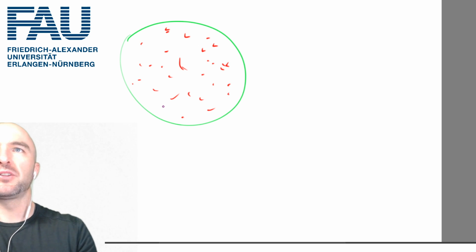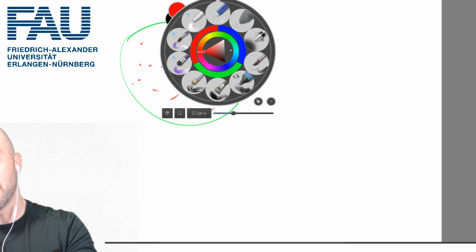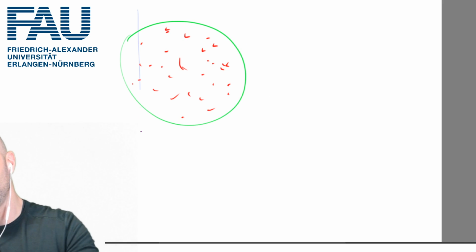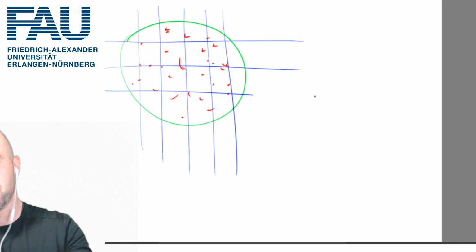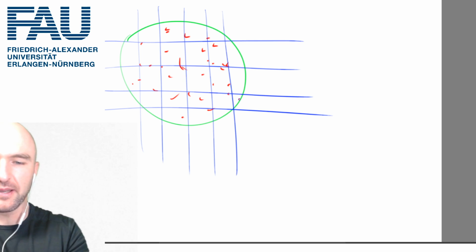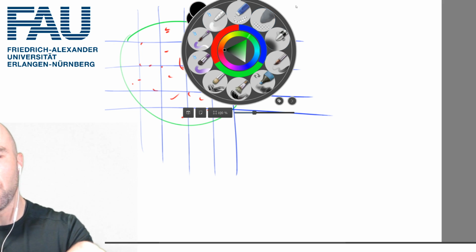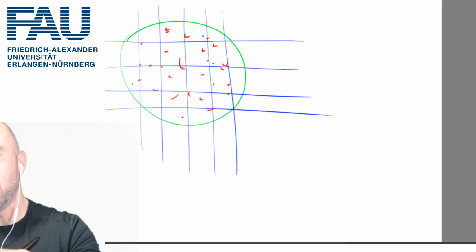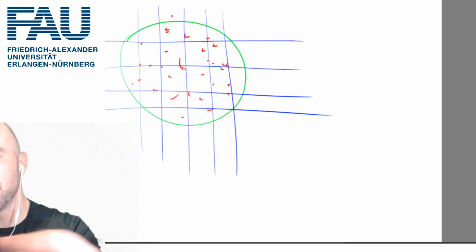And what we're essentially doing is, oh, it's finished, so it didn't take all that long to calculate. So if we are trying to put that into some kind of grid, what we're doing is essentially saying, okay, does this thing here belong to this voxel, to this bin, or does it belong to this bin or this bin or this bin or any other bin?